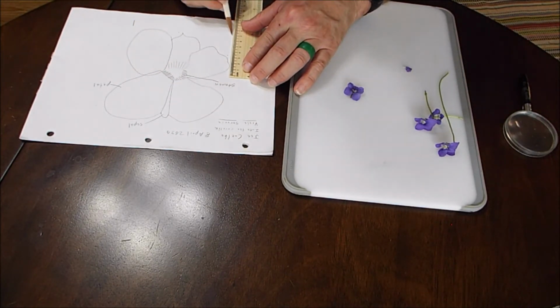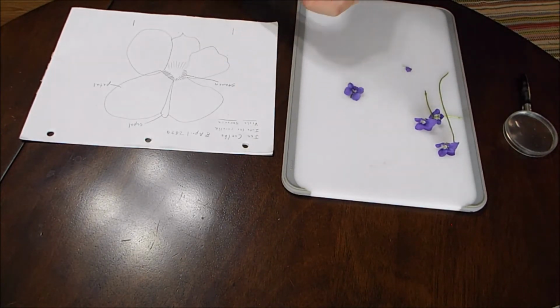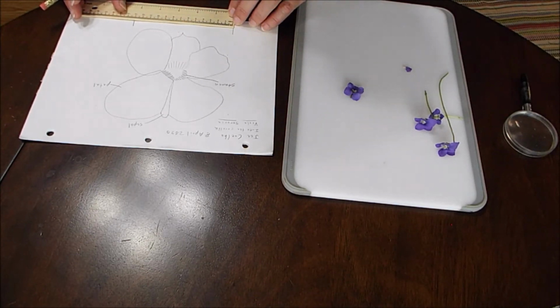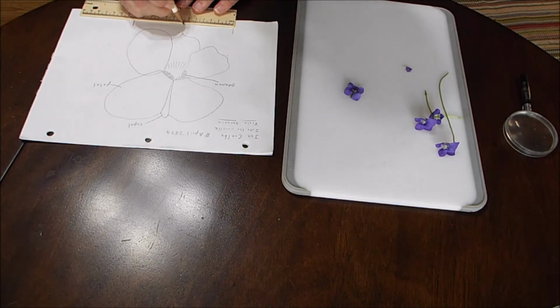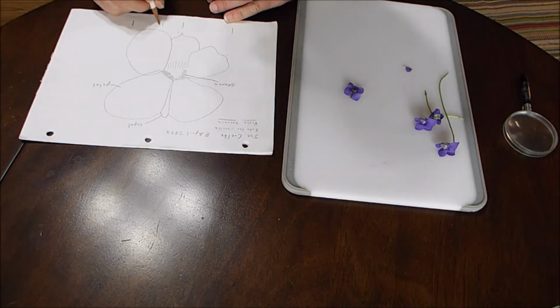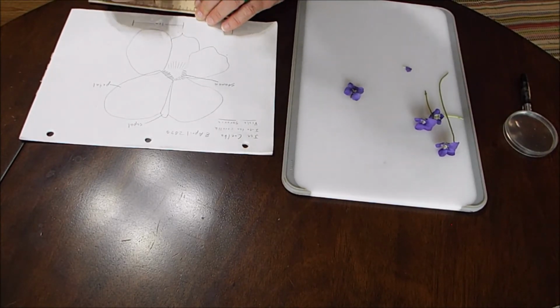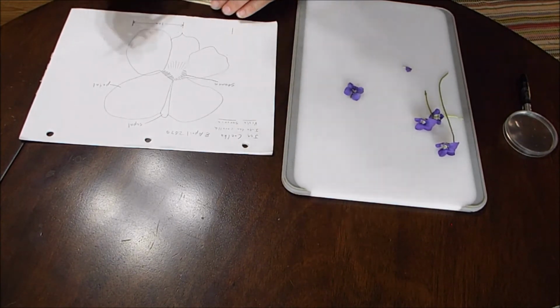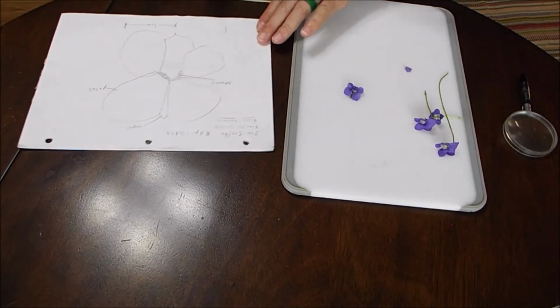You know, really, I'm going to do it a different way, just so that you'll know. Alright, so what should be 2 centimeters measures 13. So if I go 6.5 and make a mark there, that's actually 1 centimeter in real life. So we can look really cool. It makes more sense to have a 1 centimeter scale than a 2 centimeter scale, right? Alright, so ta-da! Drawing number 2 done.